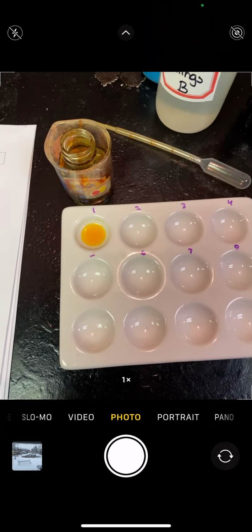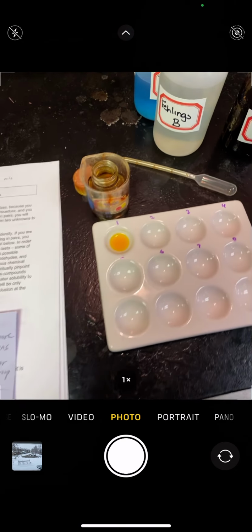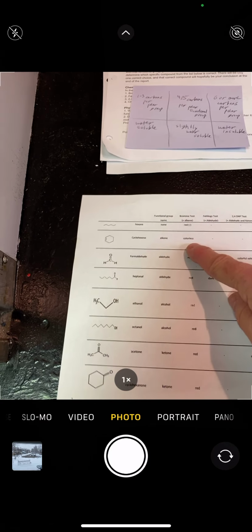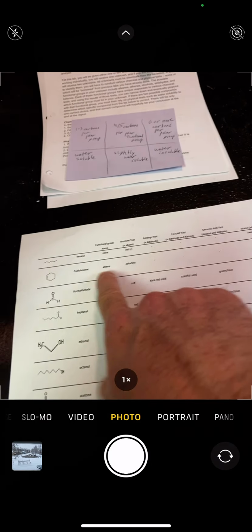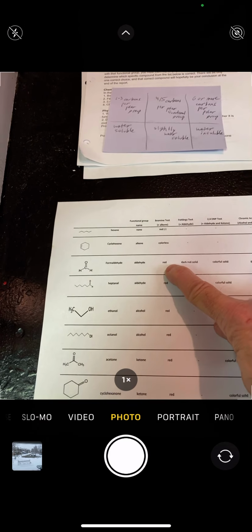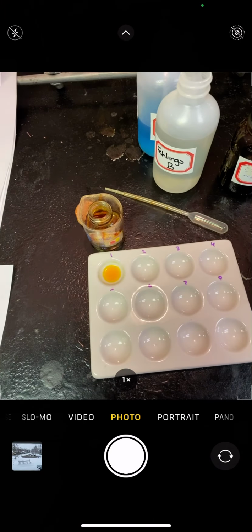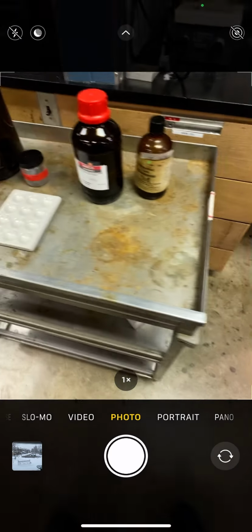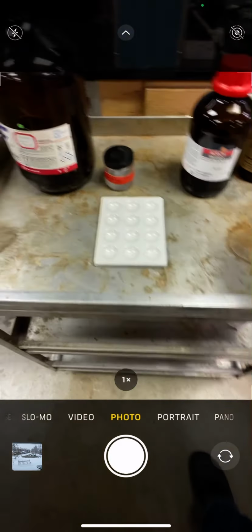It stayed orange. So for the bromine test, back on this table, if it goes colorless, then it has a carbon-carbon double bond. Well, ours stayed kind of this red-orange, right? It's kind of diluted down red-orange because the bromine's diluted down. What would it look like if we had a double bond? Well, do I have a chemical that has a double bond?